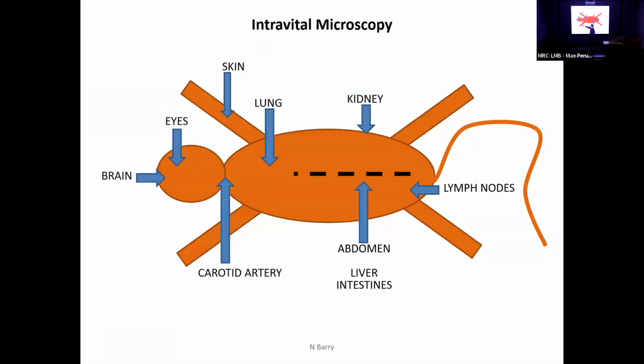And that's been particularly powerful in the field of neurobiology, where multiphoton looking into brain tissue has really generated huge amounts of insight into how circuits in the brain work. And the ability to work on freely behaving mice has been a massive game changer in that particular field.